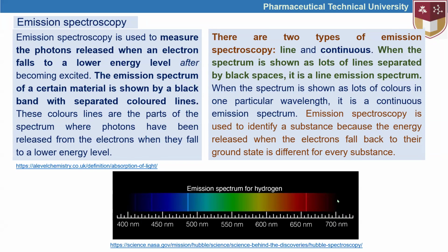Differently, the spectrum can be shown here. I apologize for these discrepancies in the text and the figure. So this kind of difference in the intensities of the light spectrum belongs to the wavelength of the light where we can observe the emission of those atoms.